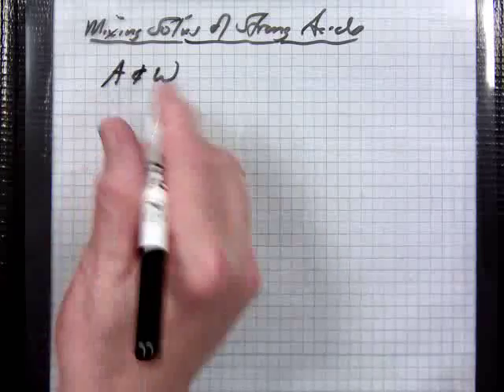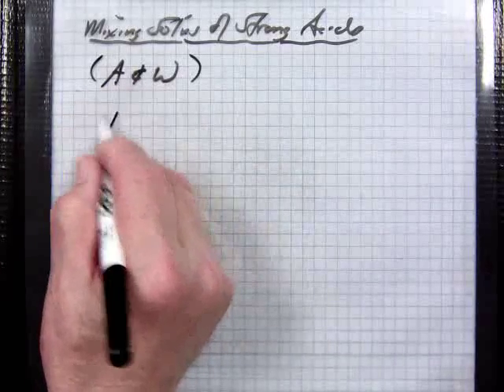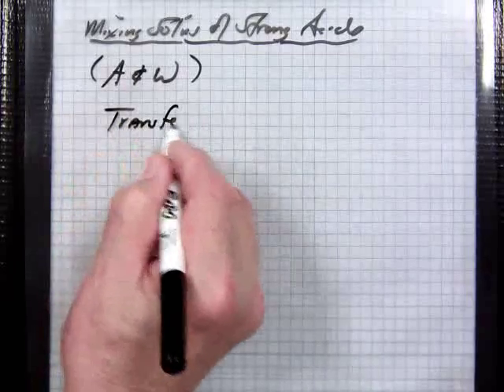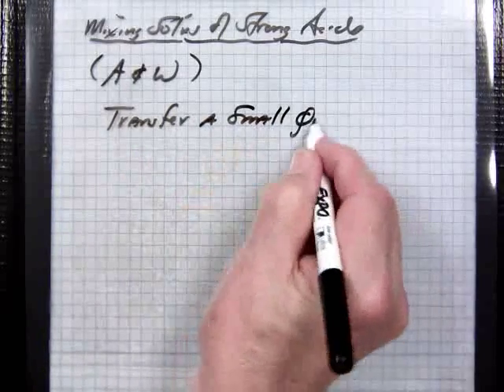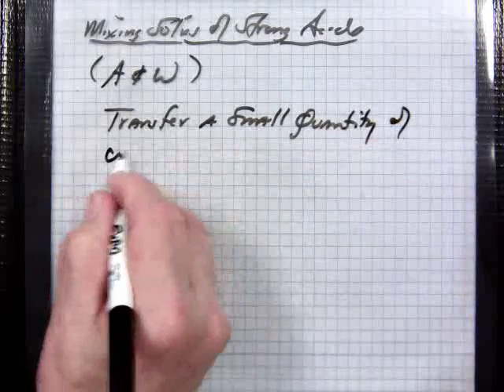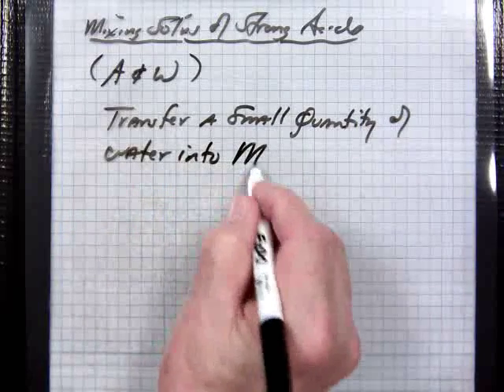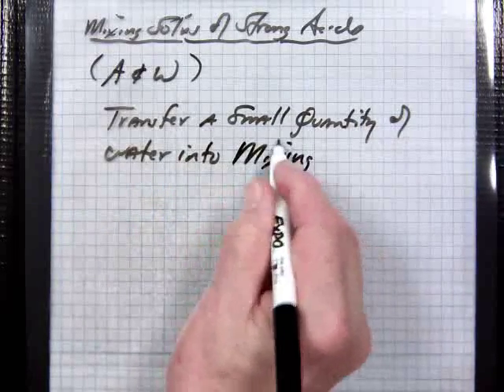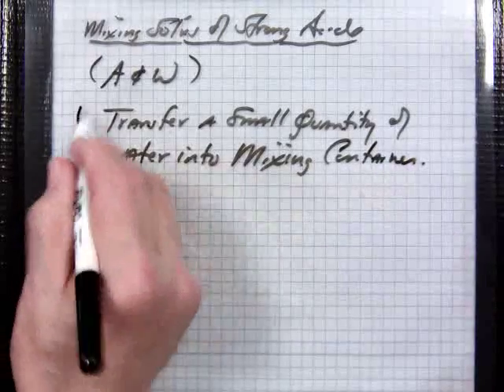So what you need to do is, one, transfer a small quantity of water into mixing container. That's number one.